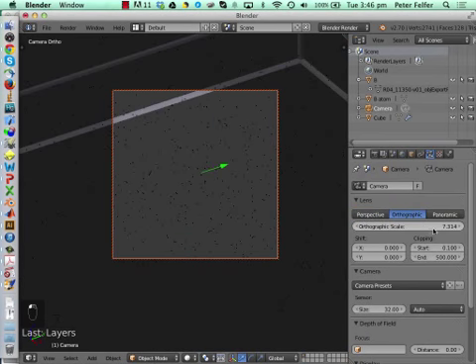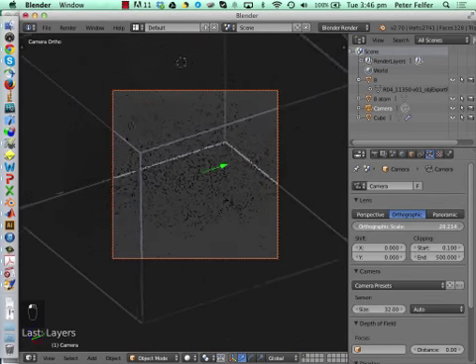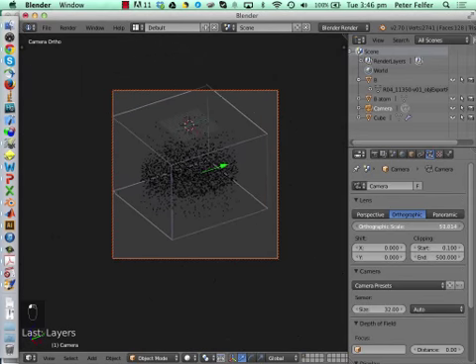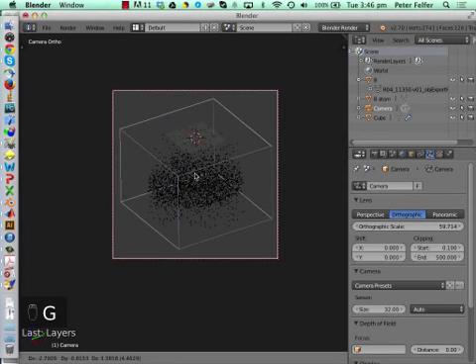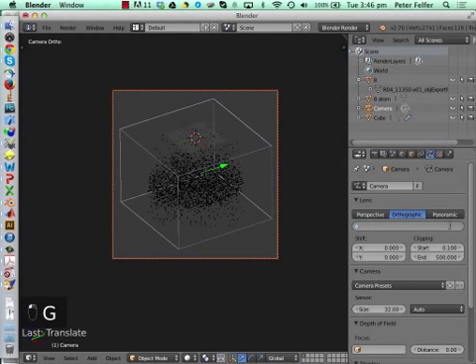And you'd go to orthographic and set it to an appropriate scale. I'll move the camera somewhere. Most of all, set it to a round number and leave that for this scene always the same, so that whenever you load your image into Illustrator or whatever, when you create your figure, you know that this edge is exactly 60 nanometers. So it's going to be very easy to create a micron bar or something like that in your publication.